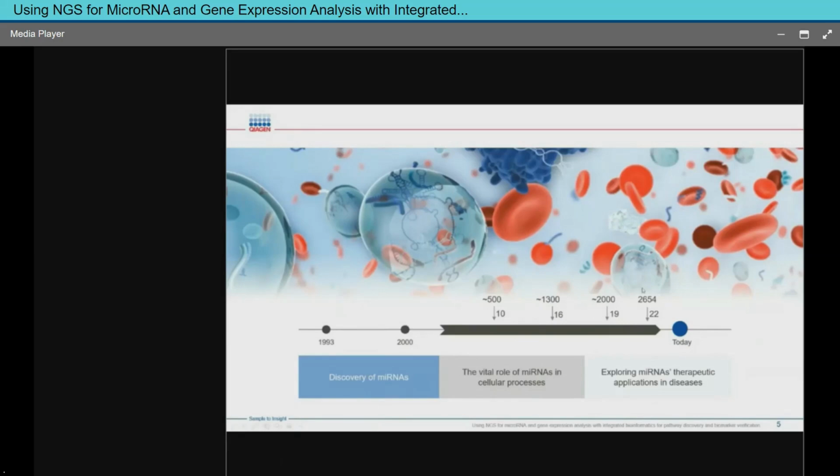When we're looking at the alignment criteria around the pipelines that we're using today, we actually have a couple of different pipelines. We're going to focus on our RNA-seq analysis portal, but we do have another pipeline set up that will give you not only microRNAs, but also piRNAs and RNA fragments. Another important thing when we're talking about NGS data analysis is the species that we may be working on. MicroRNAs are almost ubiquitous across almost all the organisms that we usually study within the laboratory, or at least all eukaryotic organisms. And usually when we think about aligning back, human, mouse, and rat have been very well annotated.